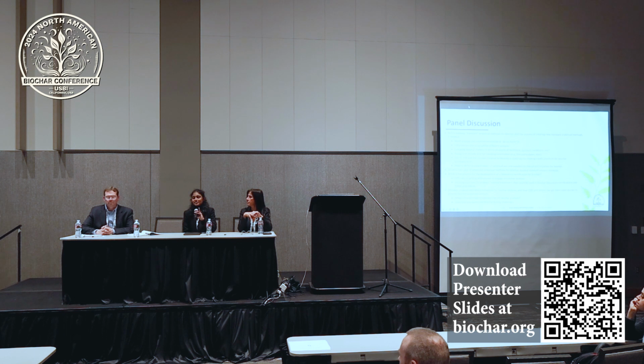Yeah, and another difference is calibration. We were actually discussing it before. So normally we calibrate at the start and then run several samples. If that is done, it's a problem. So there should be calibration in between the samples. So that gives rather accurate data. And yes, the particle size is really, really important. Grind it to like 0.2 millimeters or so, and that's when you get good sample size.